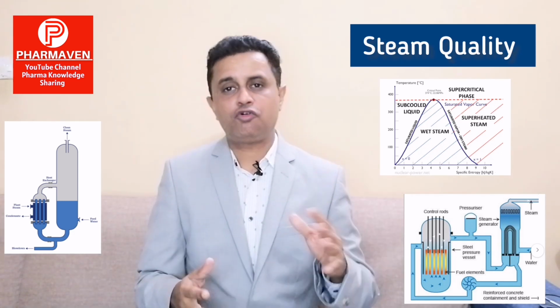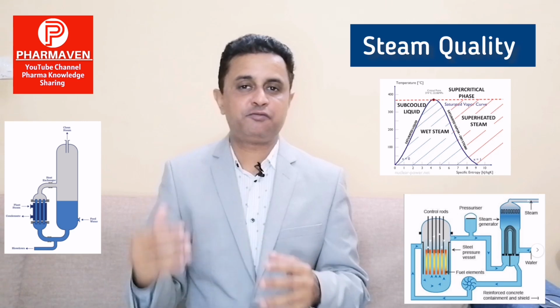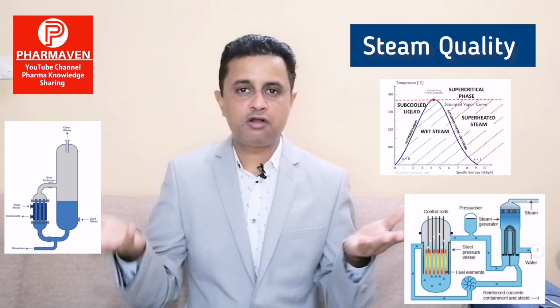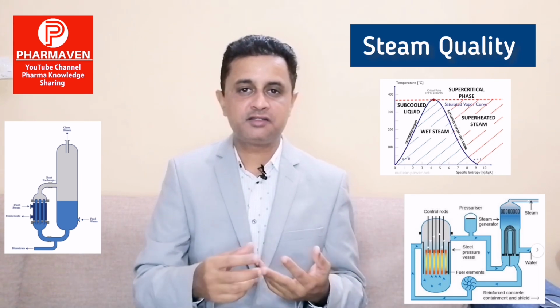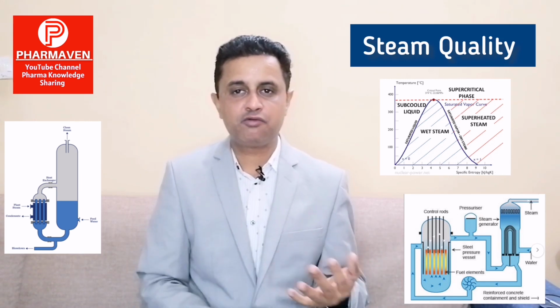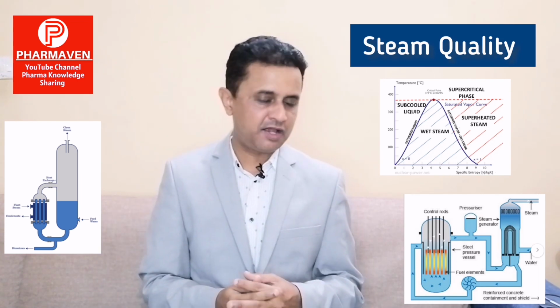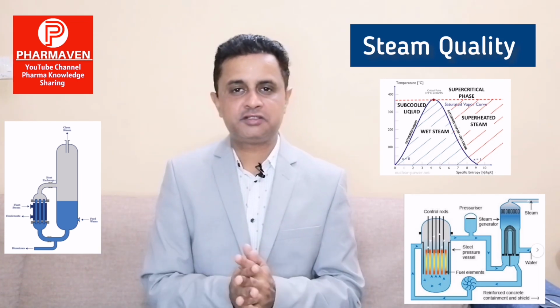So this investigation can be done stepwise or in parallel. It is better to do the investigation for all the factored items, like load arrangement, cycle parameters, BI placement, BI quality, steam quality, in parallel, so we can complete the investigation on a fast track and have a root cause as soon as possible.